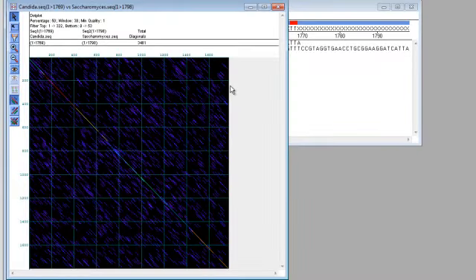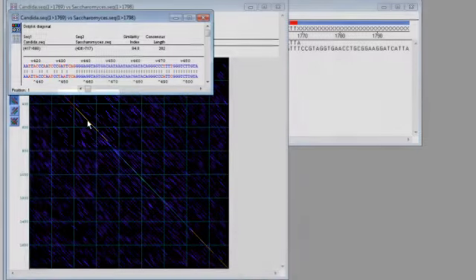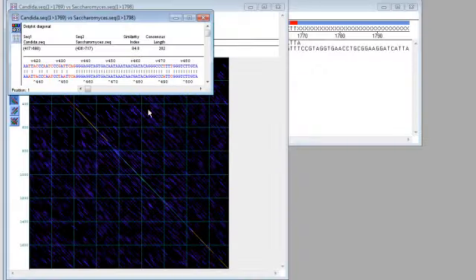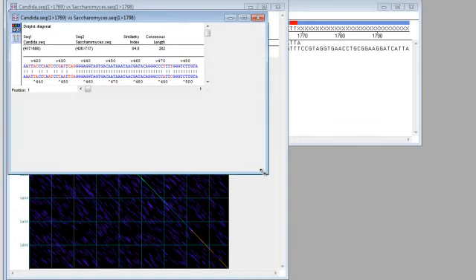To see a detailed view of how the sequences align in a given region, I can double click on one of the diagonal lines, and this opens an alignment view for that region.